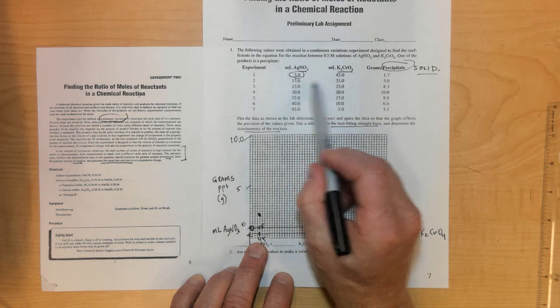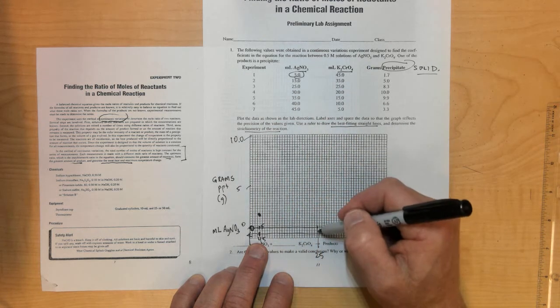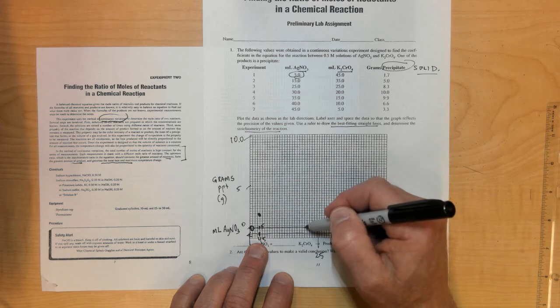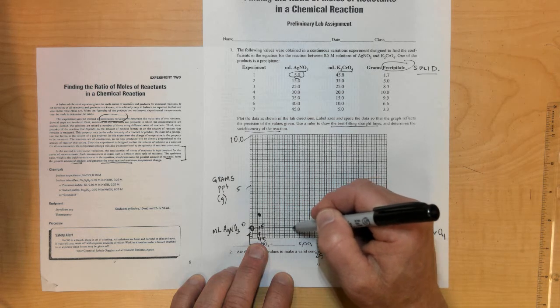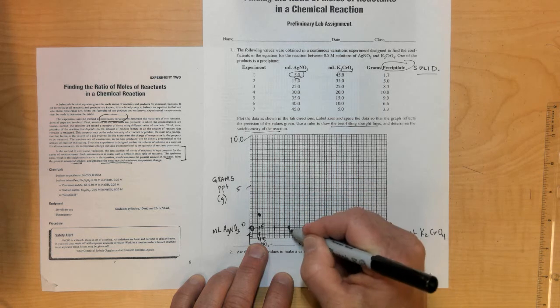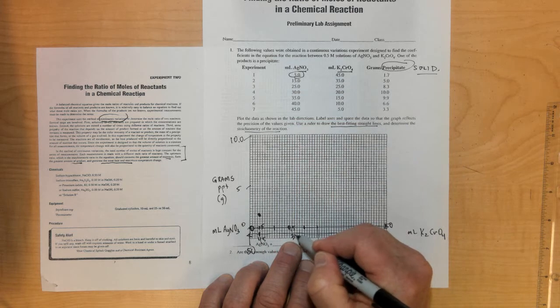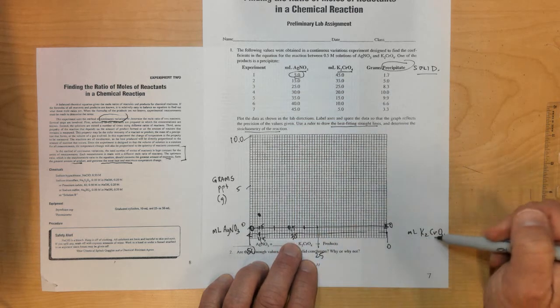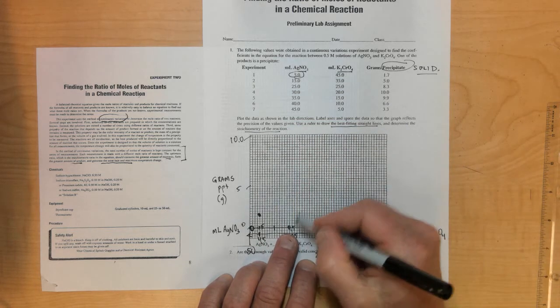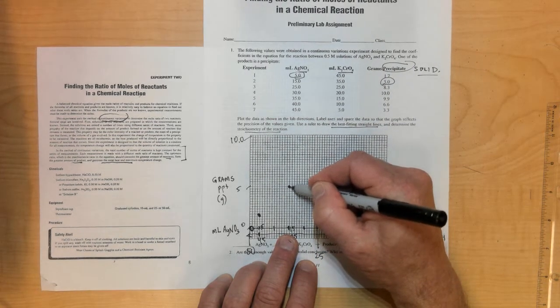My next one is 15 and 35. So if this is 5 and this is 25, this would probably be about 20. 15 would probably be right about here, and 10 would be right here. So this is 15 of the silver nitrate, and that's where 35 of the potassium chromate would be, and that value is 5. So I'm going to take that up right here to 5 and put a dot.